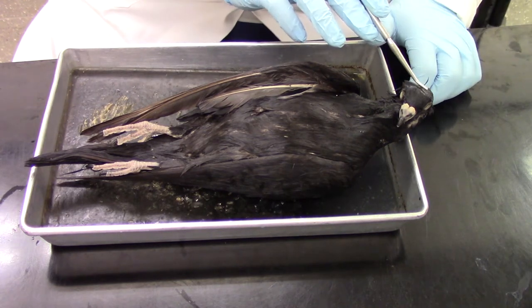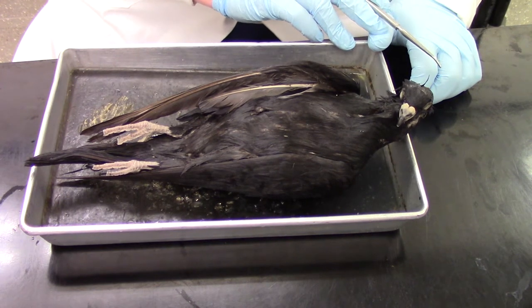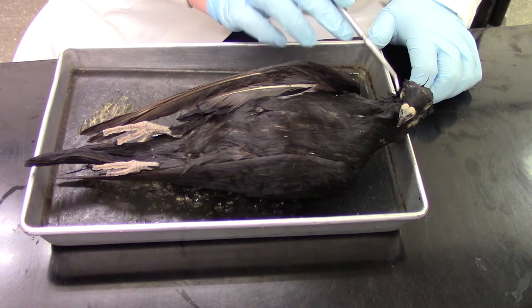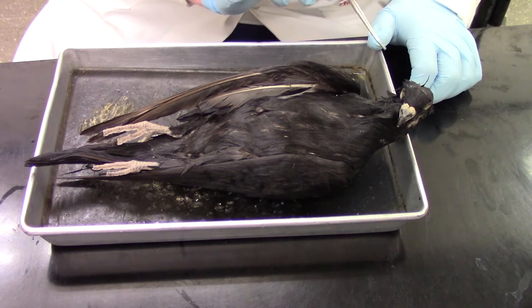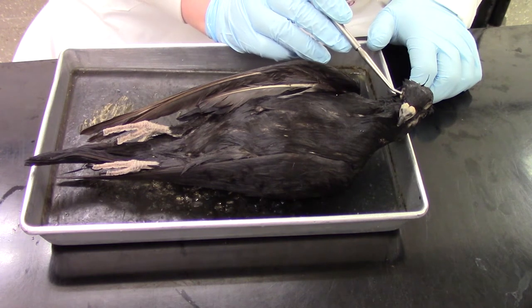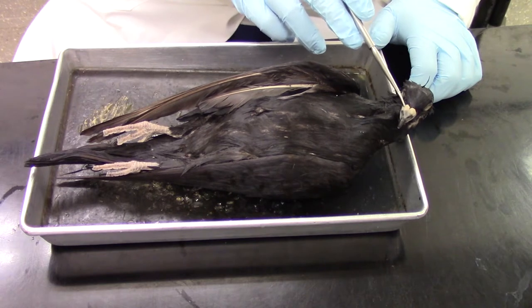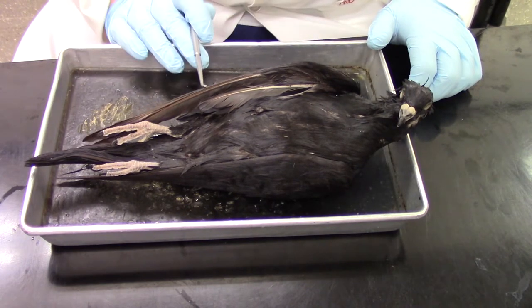If we start at the anterior end here, one of the main features we're looking for — of course we have the obvious ones like the beak, the nares within the beak, the eye over here, and then we have this band going across the beak. This is actually a fleshy portion known as the cere.